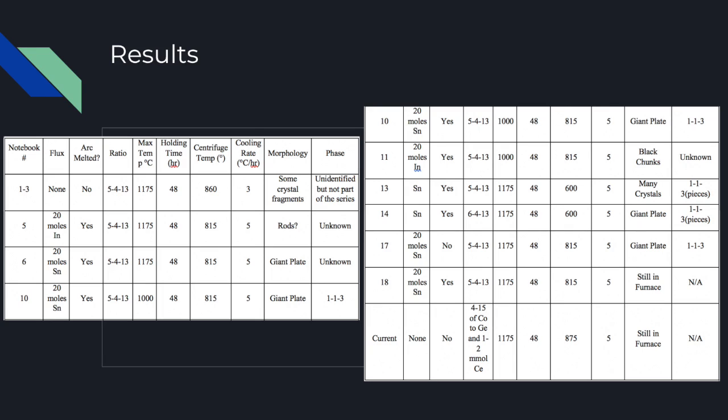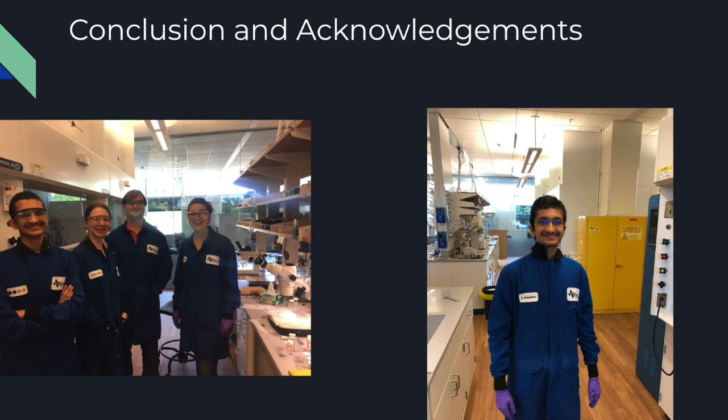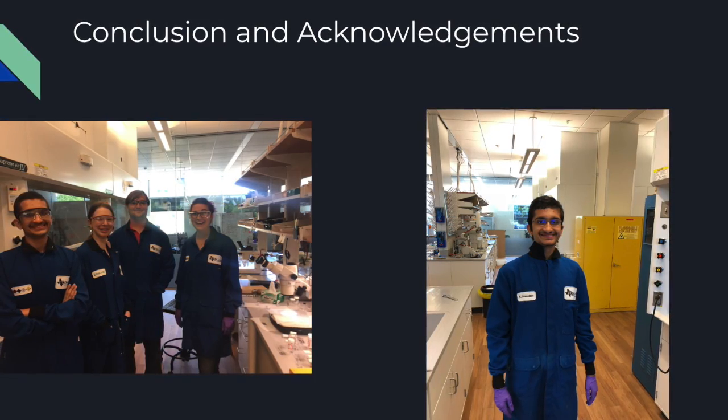To begin, it was determined that arc melting the reagents before putting them in the furnace forms the more stable 1,1,3 phase instead of the desired 5,4,13 phase. Also, it was determined that centrifuging temperature doesn't matter as long as it's below 815 degrees. In conclusion, crystal growth is an extremely important area of research that allows for future advancements to be made.